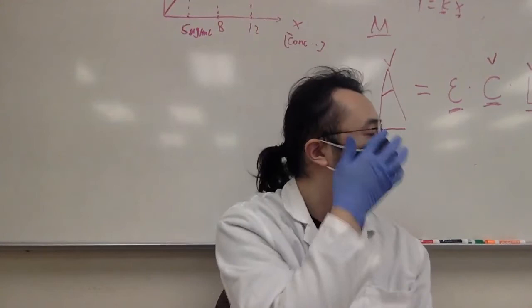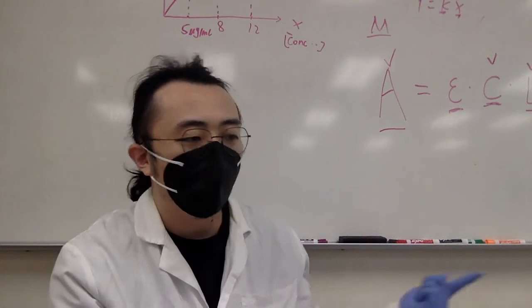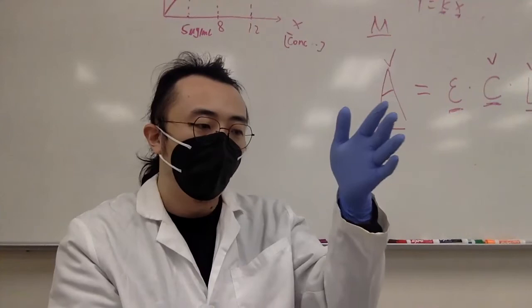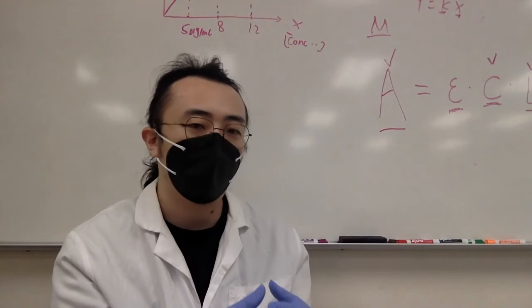For the RDQ, part of my results is the calculation, right? Yes, for example, in this lab report, the first part of the results is the data you get. Probably just make a table which lists all the data: the volume, mass, and density. So make a chart like this, which lists your mass, volume, and density for solution one, solution two. And on the bottom, show one example of the calculation, how you calculate the density, okay?